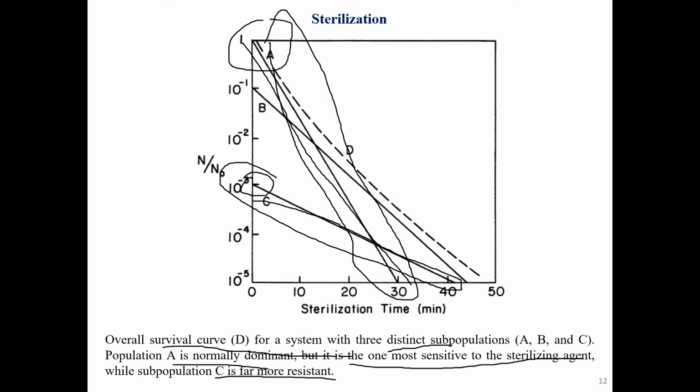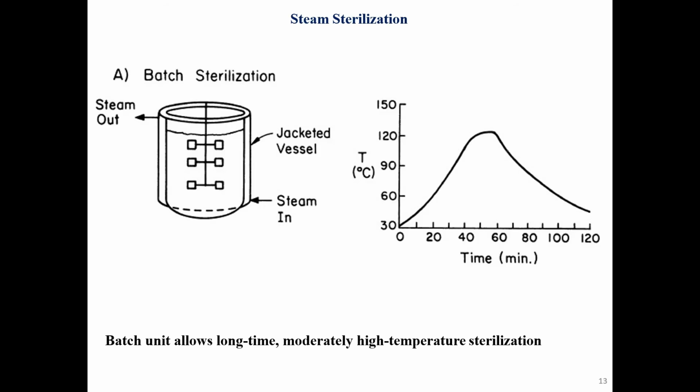So this is a simple graph. There's another thing, which is some of the terms related to sterilization. Some of the sterilization terms are steam sterilization. Let's just talk about steam sterilization first. Steam sterilization is a very easy process which is carried out by an autoclave. I guess some of you know, and for those who do not know, an autoclave is a simple process. It's basically a cylinder like this.